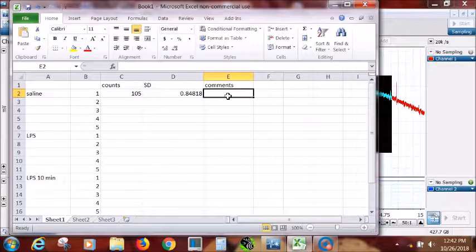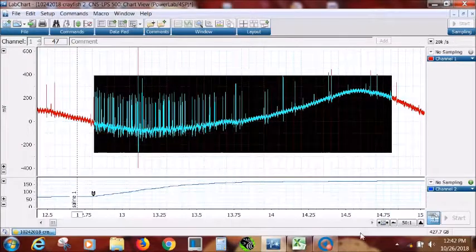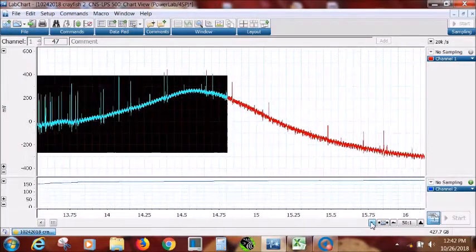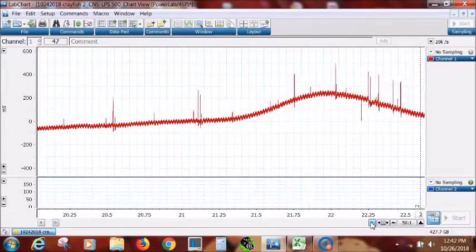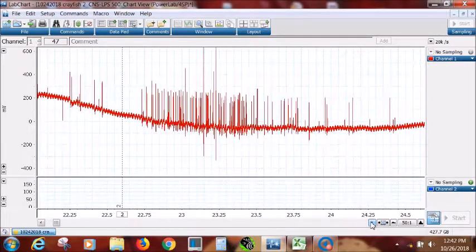And we can say this was good. It wasn't too noisy. And now we can do the number 2. Let's put that down. And let's move over to the second one. Let's just do 2 as an example. So here's 2 right here. And if you click back over here, the little marker appears back over here in the bottom left corner. And let's put that up there.